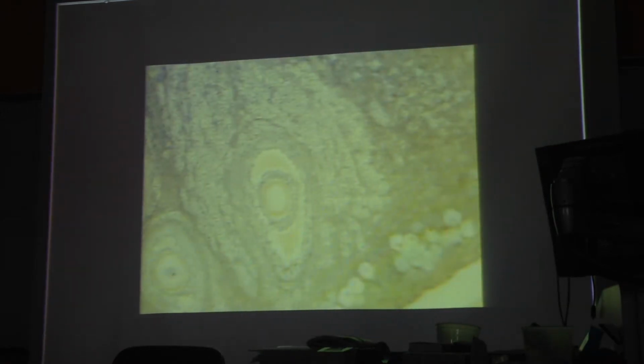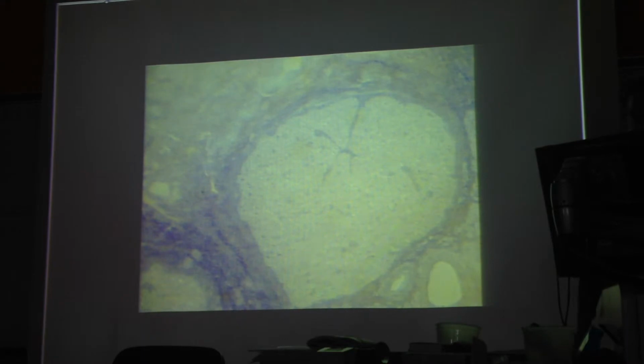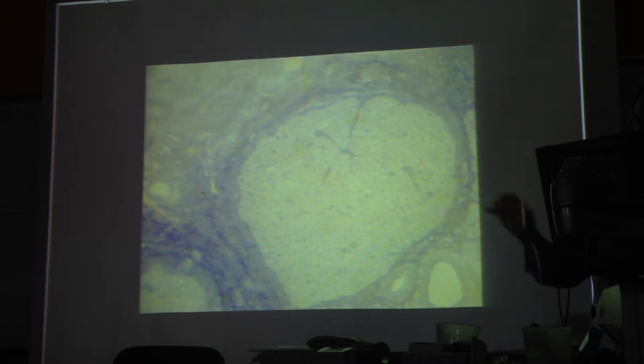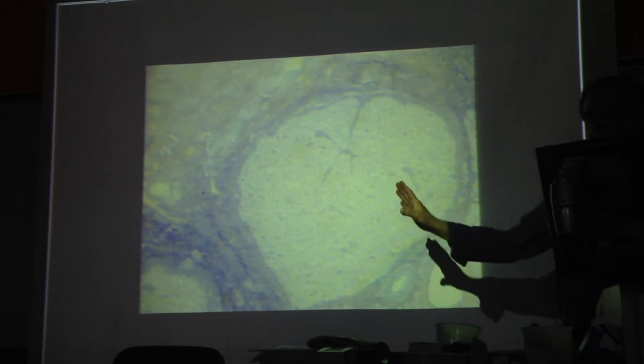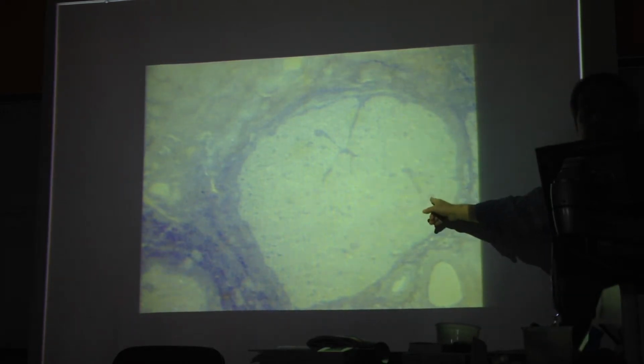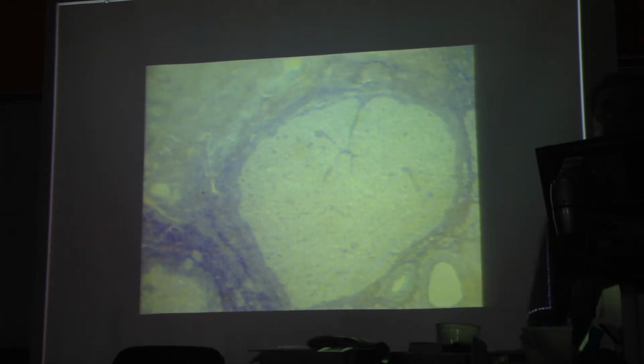And then something else, this structure right here. What is this? What's it called? What happens after ovulation? The egg's released, but most of the follicle remains behind. It develops into this structure under the influence of hormones. This is the corpus luteum, literally Latin for yellow body. There's kind of a yellowish cast to it.